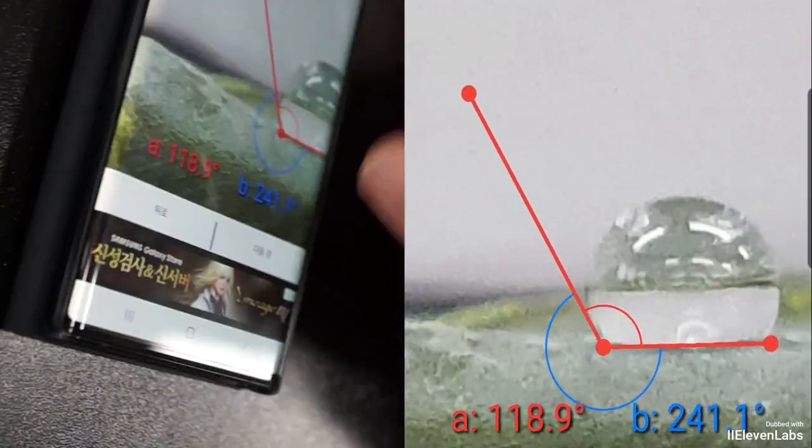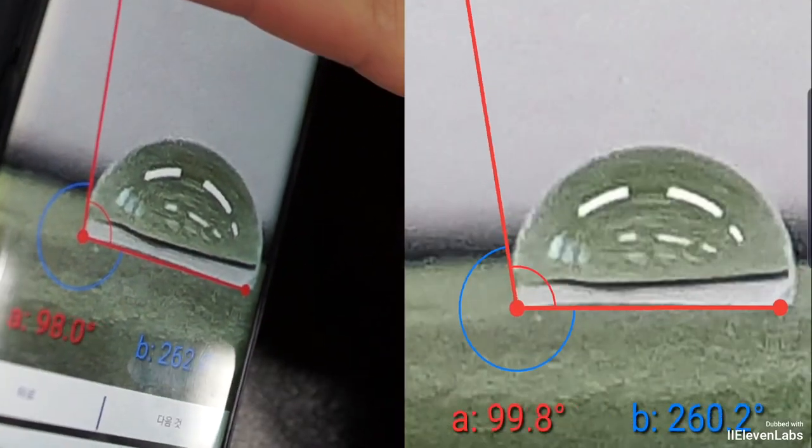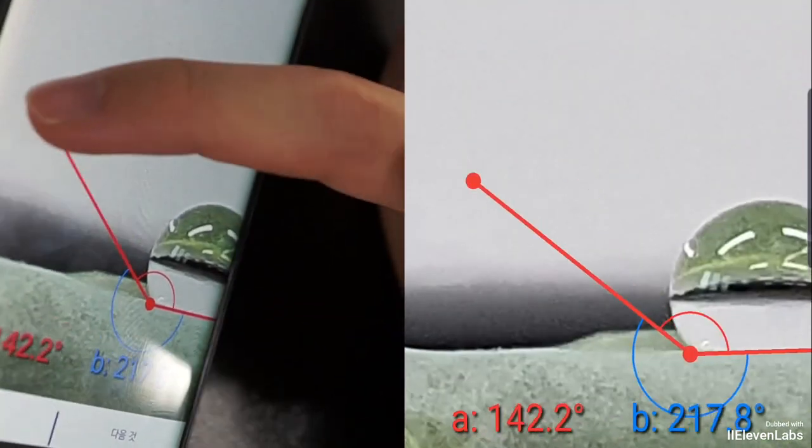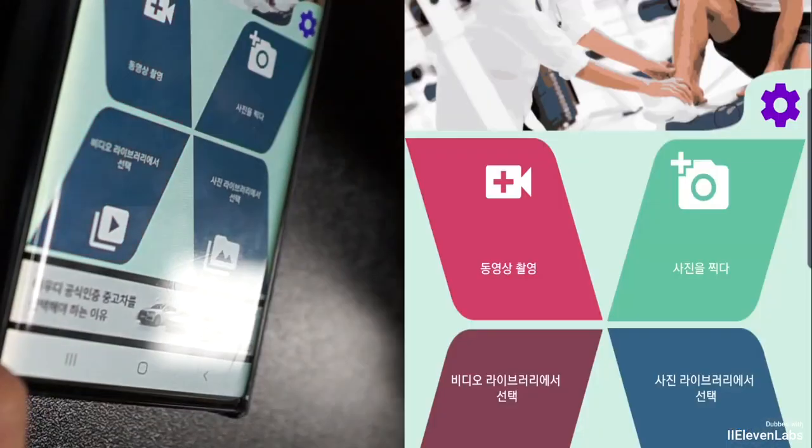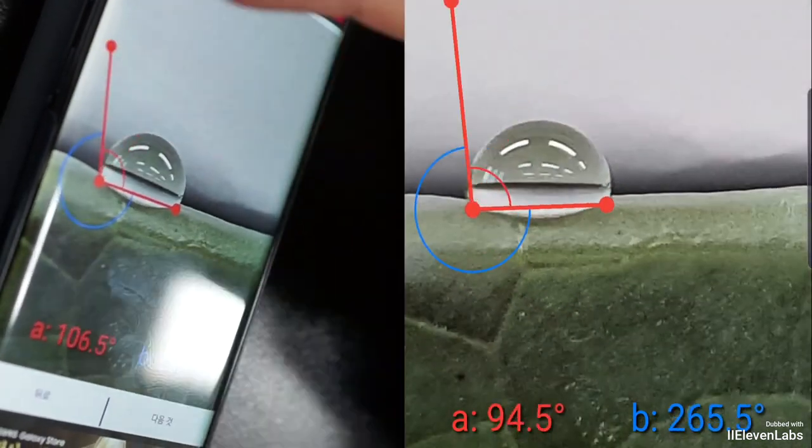When water is sprayed on the surface, the interaction between the water and the plant creates two contact points which form the angle. By understanding and adjusting this angle, you can determine the wettability of the plant surface—essentially you can tell if it's hydrophobic or hydrophilic.